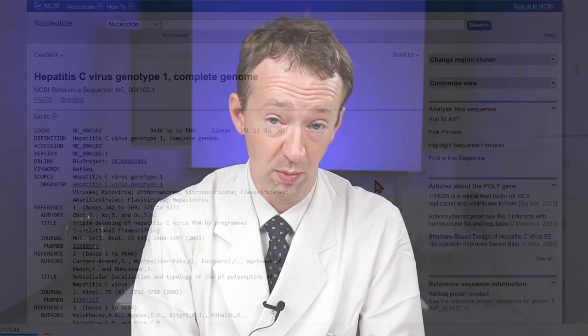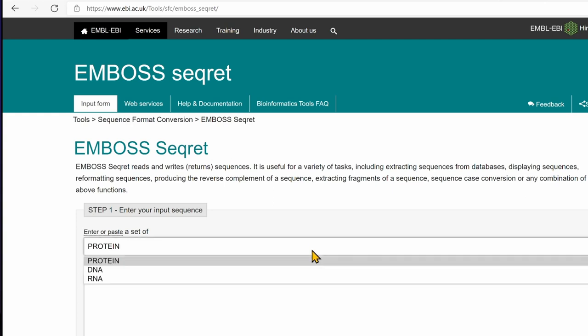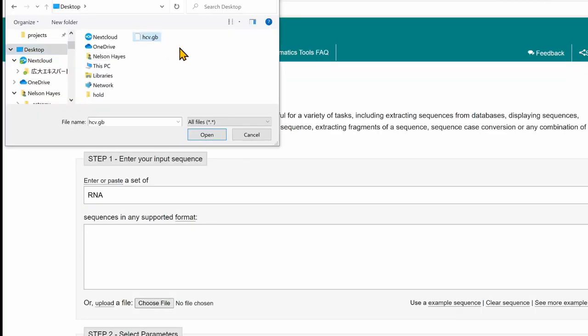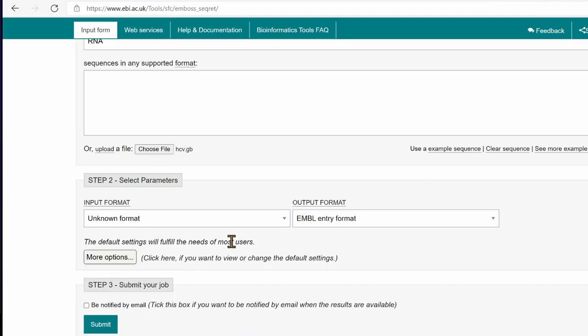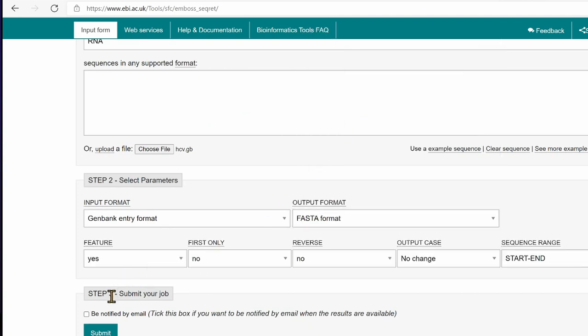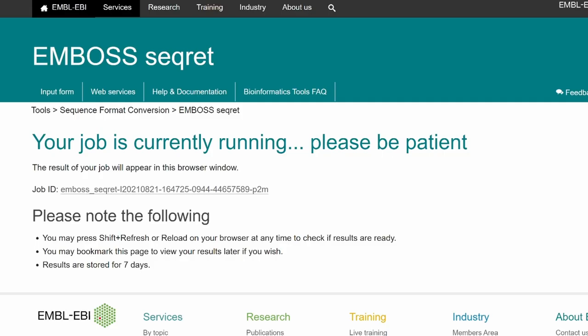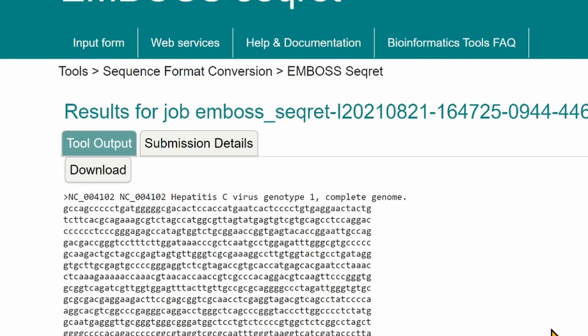But what if you already have the sequence but it's in the wrong format? Let's say we only have the GenBank file available. There are a few options, but the simplest approach is probably to use the EMBOSS Seqret web tool on the EMBL-EBI website. Here you select the sequence type — in this case RNA — and then choose the GenBank file to upload. We select GenBank entry format for input and FASTA format for the output. There are some other settings under more options, but the defaults should be fine for most purposes. Then click submit and wait for the job to run. When it finishes, you can download the file. Here you can see that the accession is listed twice on the description line, so you might have to make some small adjustments, but overall this tool is very powerful and easy to use.